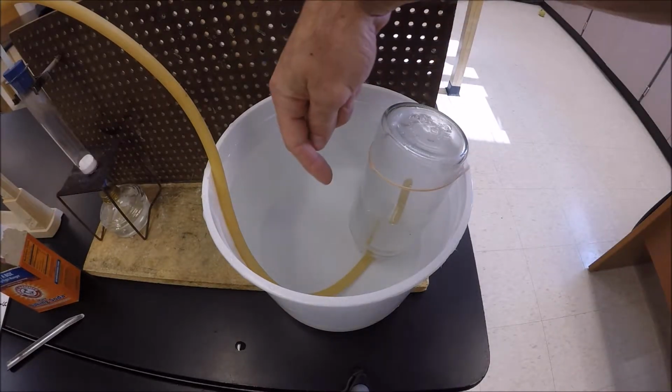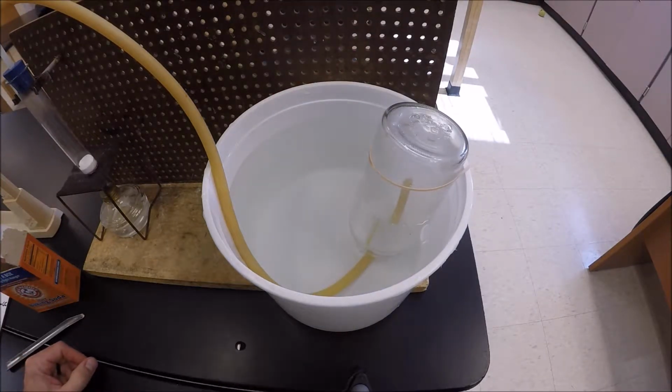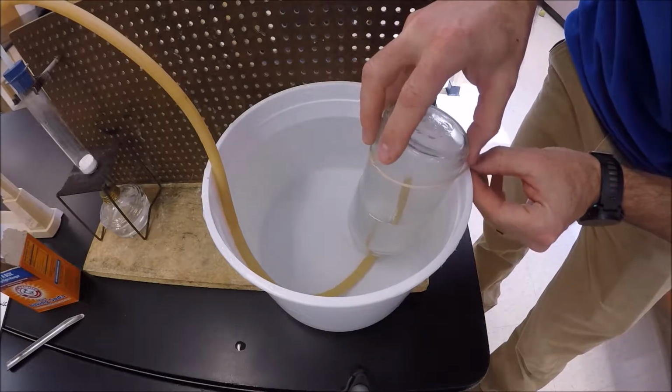At this point, I can see that the water level is pretty low, so I'm actually going to blow out the flame. And what I'm going to do is, really carefully, hold the top of this jar.